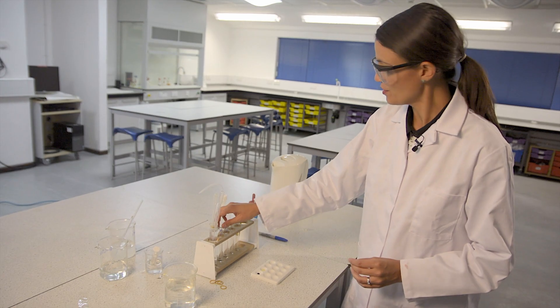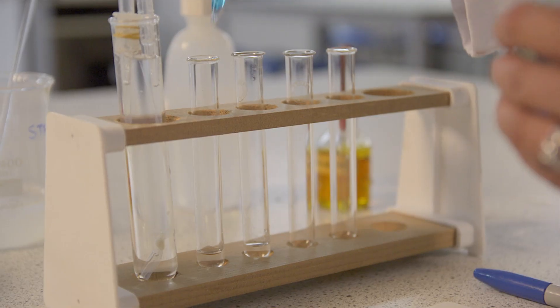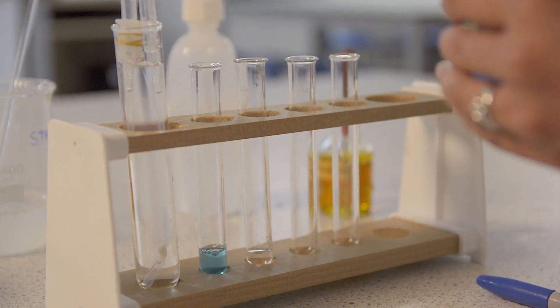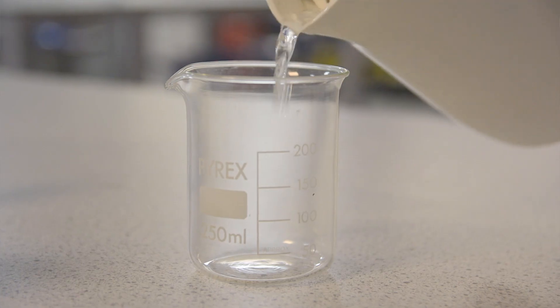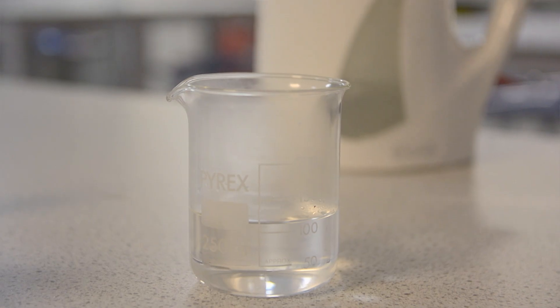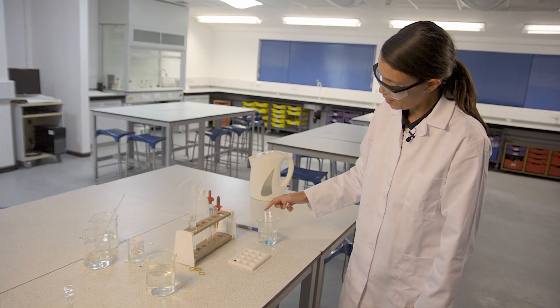In order to test for glucose, we're going to add some Benedict's reagent to each of these two samples and place them in a warm water bath — just a good squirt of Benedict's reagent into each test tube. I've just boiled the kettle, so a little bit of hot water into a beaker. This can take a minute or two to show up, but if glucose is present, we should see a colour change from light blue to an opaque orangey-brown colour.